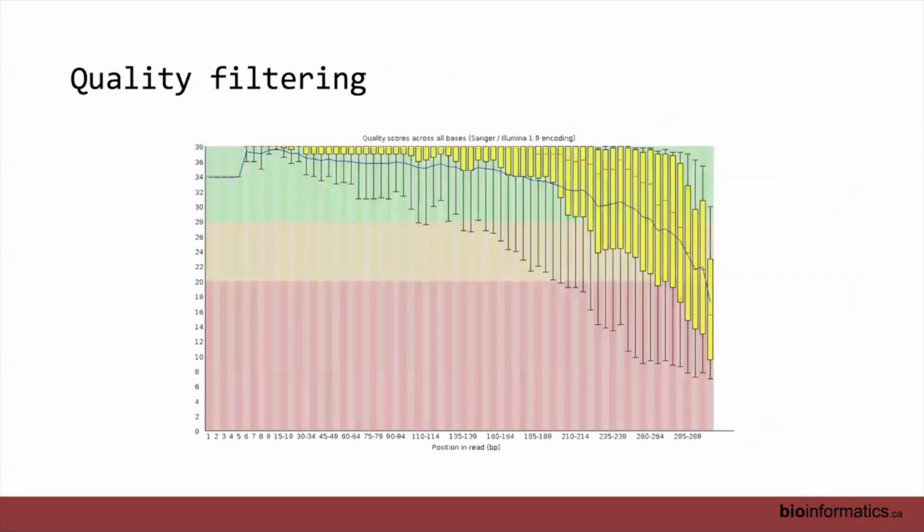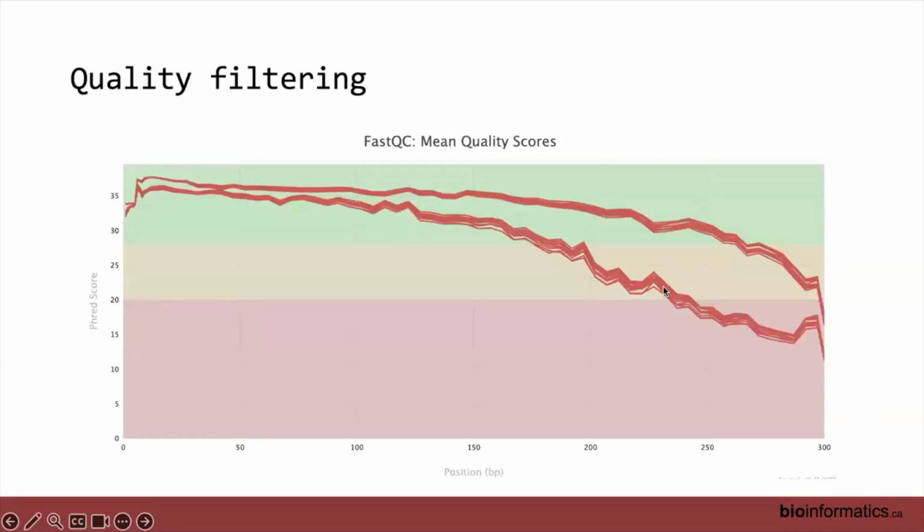And then Morgan already went through quality filtering, and you've done some of that this morning, so I won't labor on this point. Only that you will notice in QIIME it's a slightly different visualization that you'll see for the quality of each of your sequences. But as we discussed earlier, the reverse reads do always have a lower quality than the forward reads. That's just something that affected the machines, but it's worth bearing in mind when you're looking at them again, that it's not a panic that they have lower quality than the forward reads.